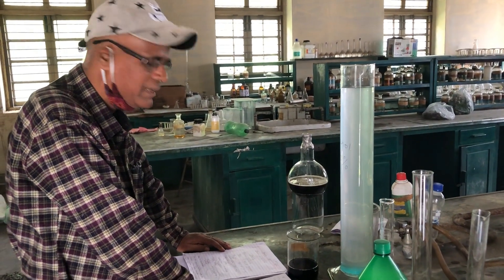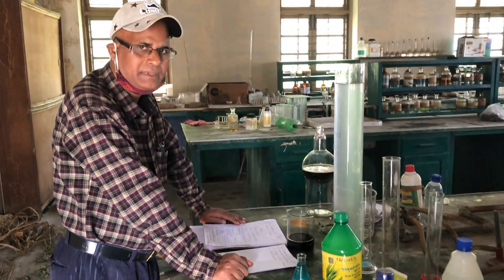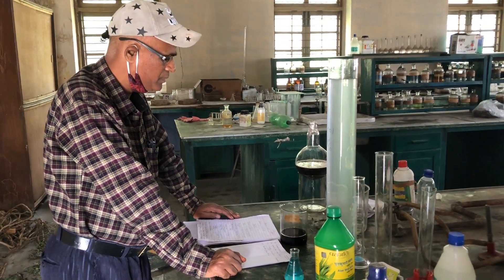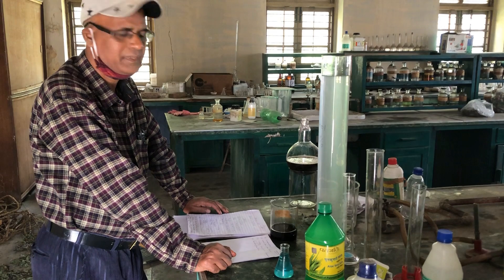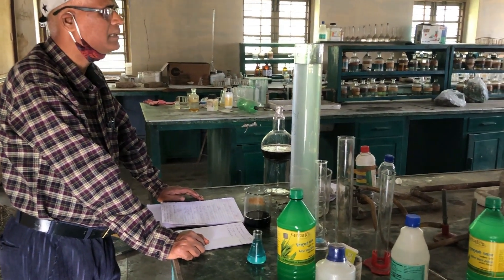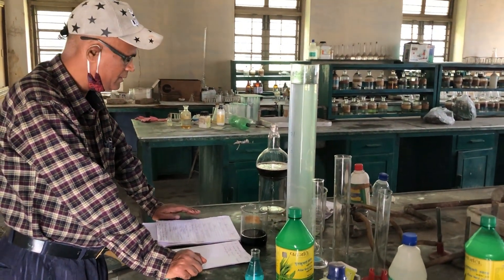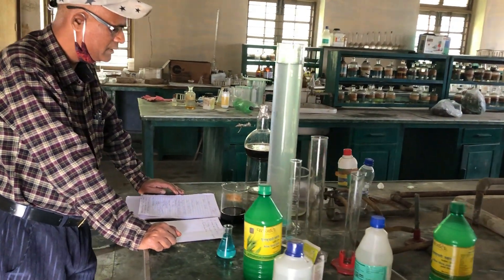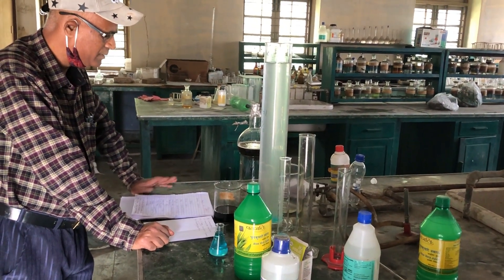I am very happy to prepare the MAPS Sanitizer. MAPS means I have taken medicinal and aromatic plants, as well as other ingredients: Ethanol, Glycerol, and Hydrogen Peroxide. These are all components made in a fixed ratio.